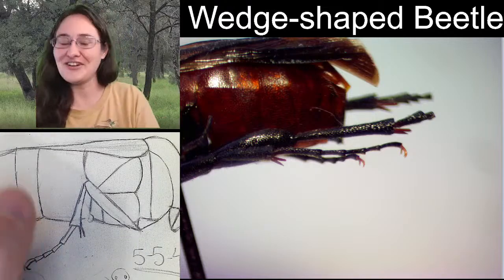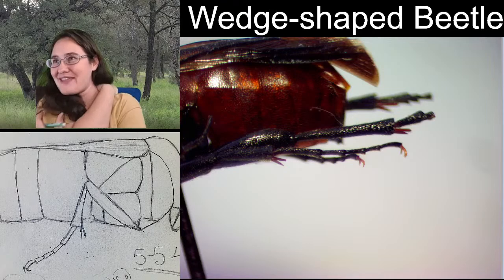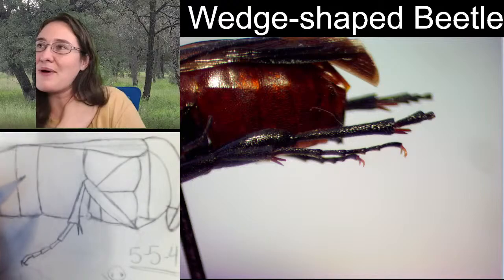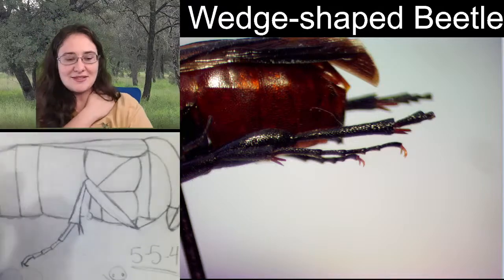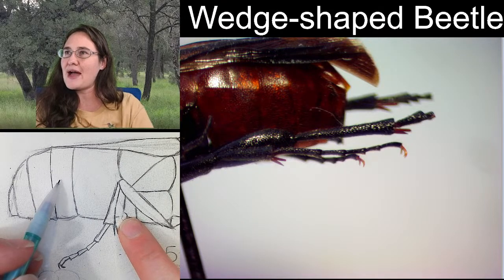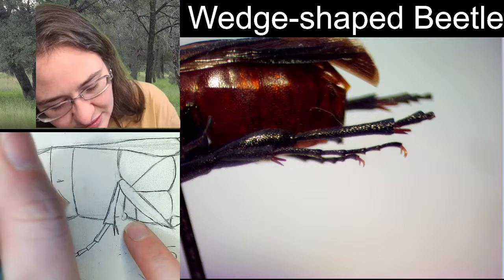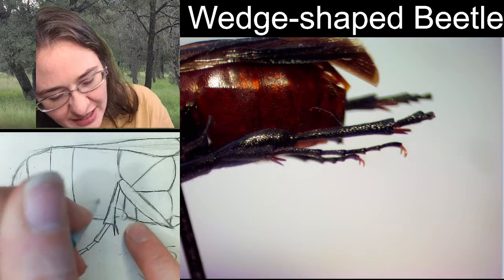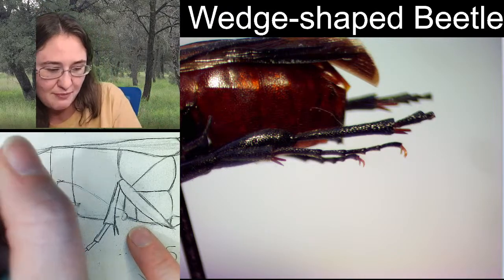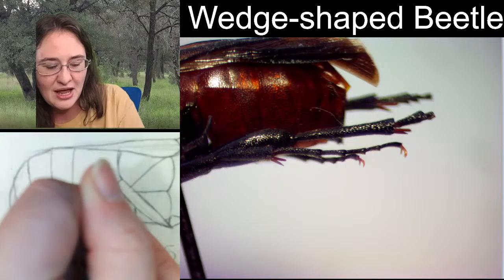All right, thank you. So this femur right here is almost bulbous on that hind leg. You can see that it gets a lot wider at the end. And our femur, where it's going to start here, is probably going to protrude all the way to about the middle of the abdomen, so probably around here. I'm going to give myself a light outline to see if I can make the shape I like, because I do want to make sure that the expansion, that bulb on the hind leg, is pretty obvious.